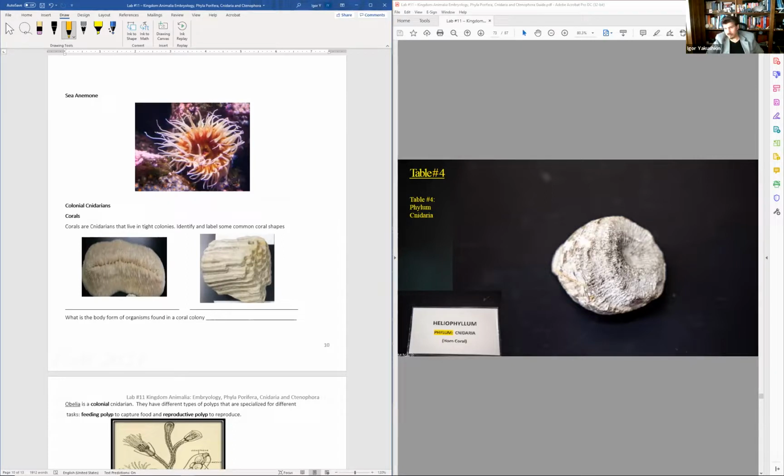Horn coral because on that particular side, whenever you're looking at, I don't think I have a horn coral, but basically you're looking on one side, it looks like this, right? And then whenever you are flipping it over, it starts looking like a coral. That's not a coral, but it's similarly looking like this. So it looks like a horn, I guess. So that's actually a part of the endoskeleton for the mollusk. We'll talk about that later on.